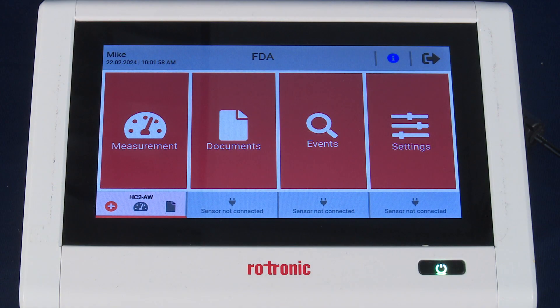Once we've completed the sample preparation, we want to move to the Hygrolab main screen. There are several screens from which you can start this procedure, but for today's demonstration we want to be sure we're on the home screen. You can get there by pressing the home button icon in the top right of the display.